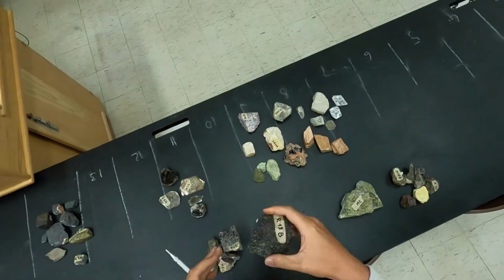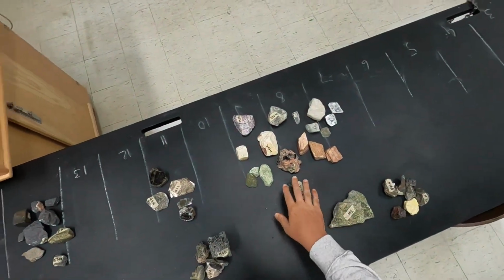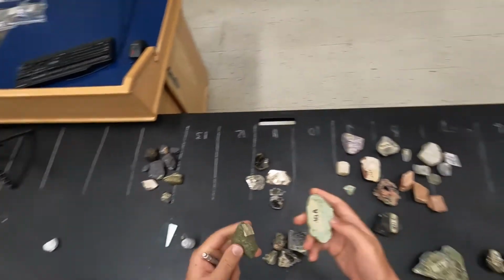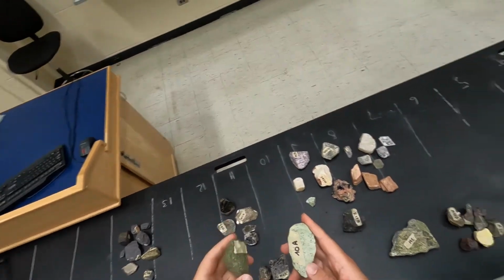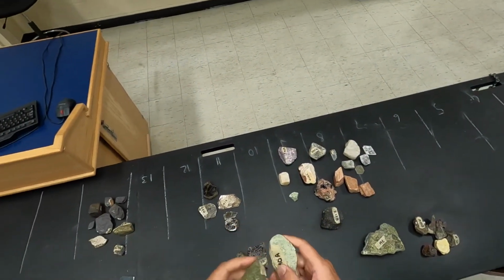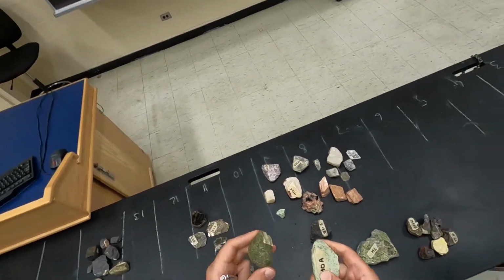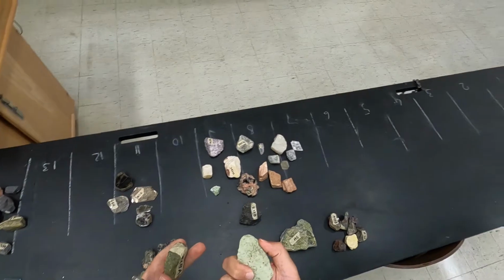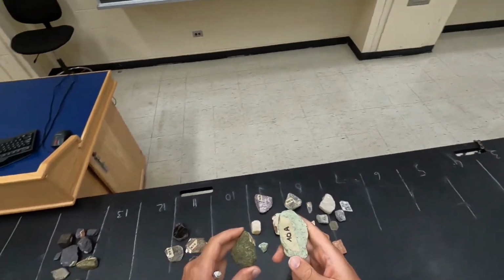And yes, if we look at an enlarged version of these small crystals, we can have different varieties. Really, this is a bit darker, this is a bit lighter, but that's because of the matrix of these rocks. They tend to have different proportions of olivine, and so the color will change.